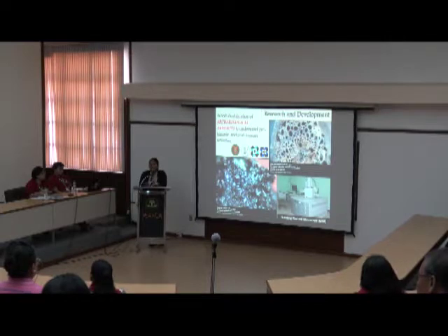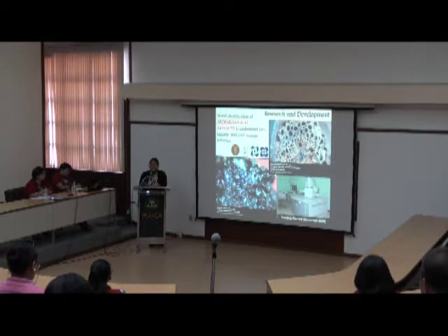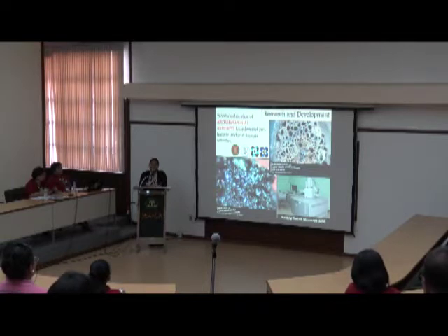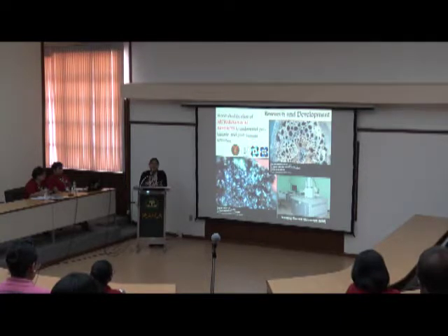And also, we have worked with the UP Diliman Archaeological Studies Program with Jane Carlos there, and we rendered service to them. We identify mga petrified wood shard, mga desiccated, mga waterlogged woods, wherein decades ago they excavated those wood samples and brought them to FPRDI for wood identification. It is very important that we also have the scanning electron microscope, which is used to identify yung highly deteriorated wood samples. With this, we contributed in understanding the prehistoric and past human activities.